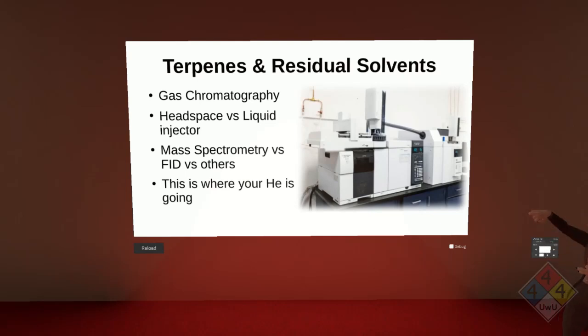And what feels good. Now, this is the gas chromatography system. This is what I actually have my specialization in, and this I can do multiple lectures on separately. And this is where I'm currently getting my bread and butter. So this is what would be called a subject matter expert, particularly in cannabis, but I do a bunch of other things at this stage.